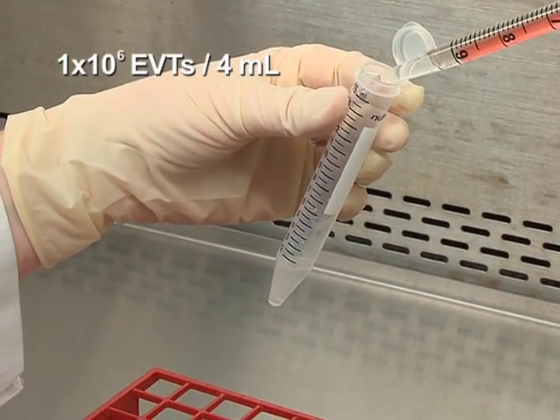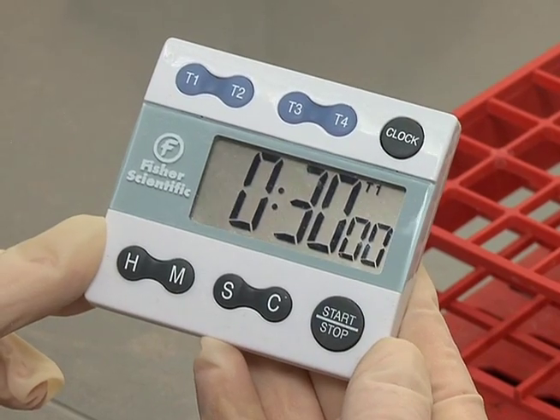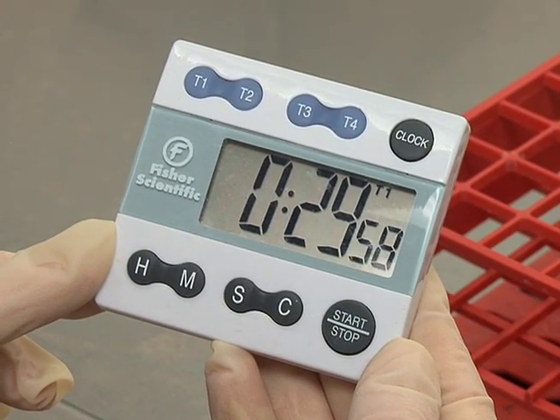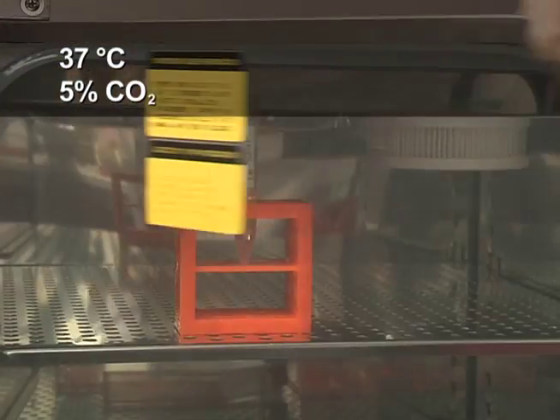Mix the EVT cells with the Cytodex-3 beads. Incubate at room temperature for 30 minutes with periodic mixing, followed by 30 minutes in a cell culture incubator with occasional mixing.